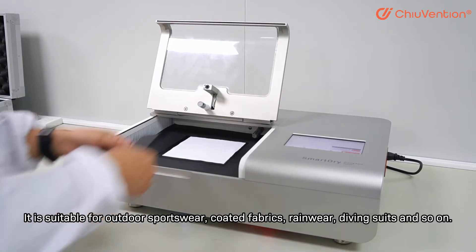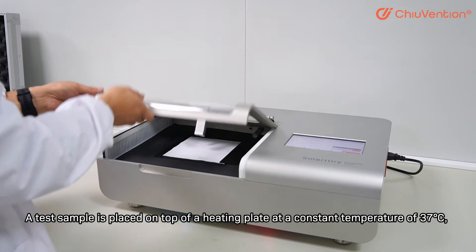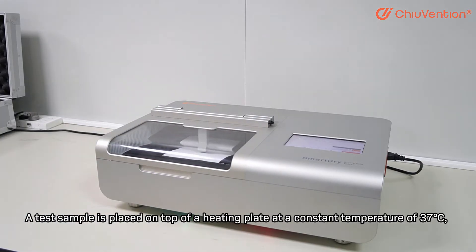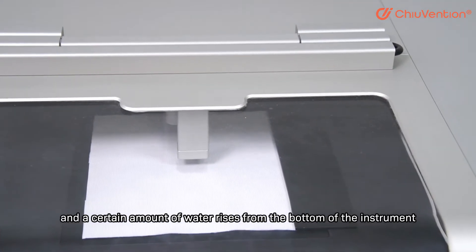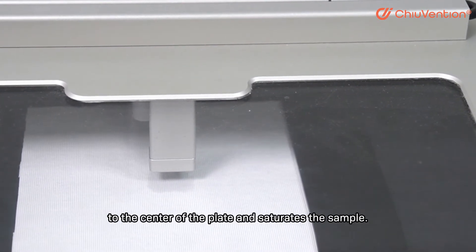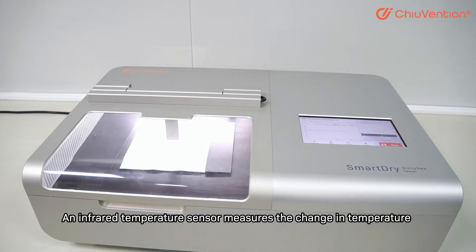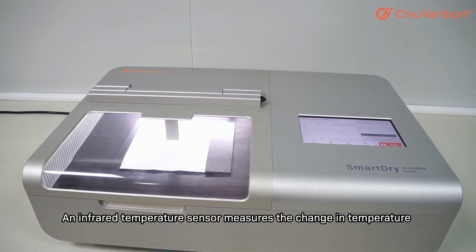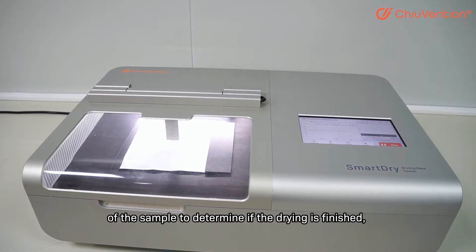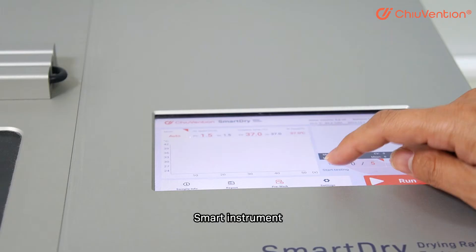A test sample is placed on top of a heating plate at a constant temperature of 37 degrees Celsius, and a certain amount of water rises from the bottom of the instrument to the center of the plate and saturates the sample. An anemometer inside the instrument dries the sample, and an infrared temperature sensor measures the change in temperature to determine if drying is finished. The drying speed is then determined by the test drying time.